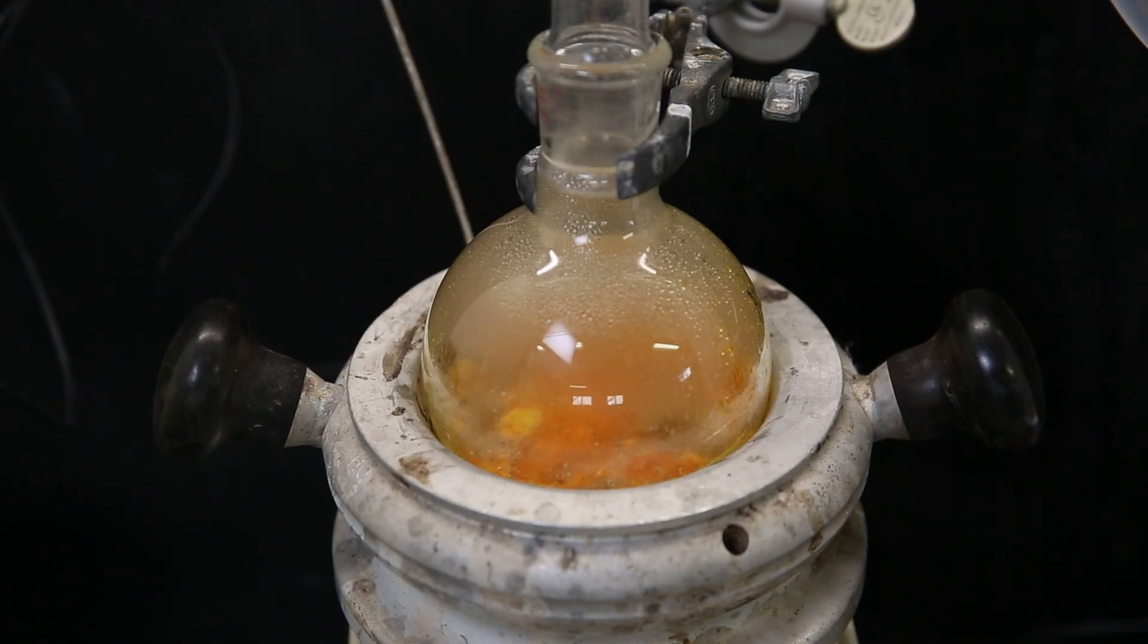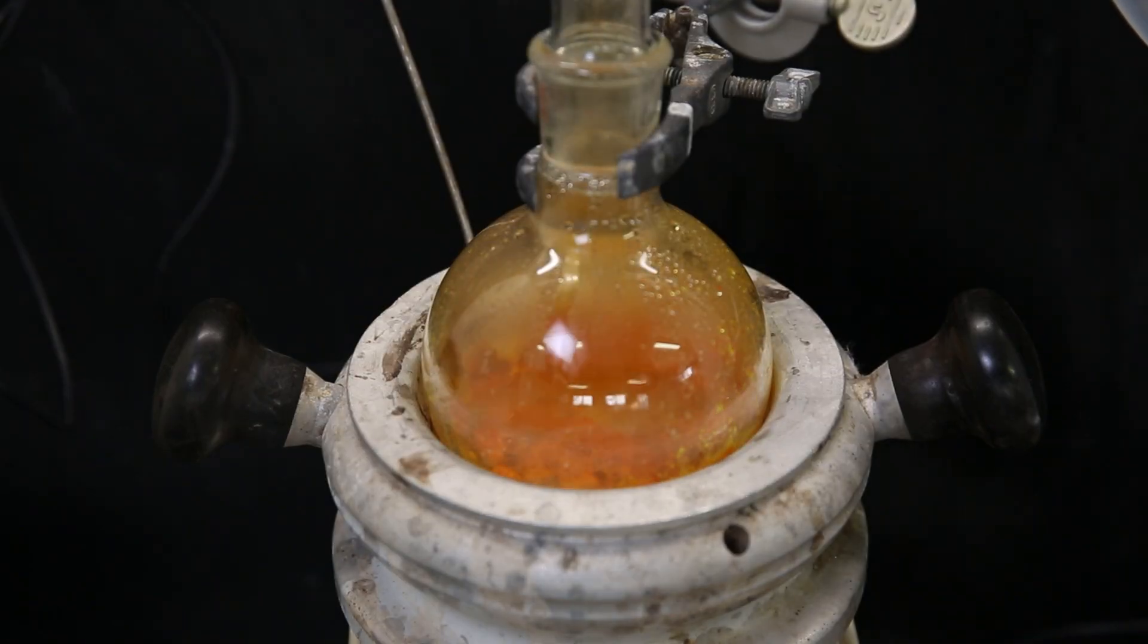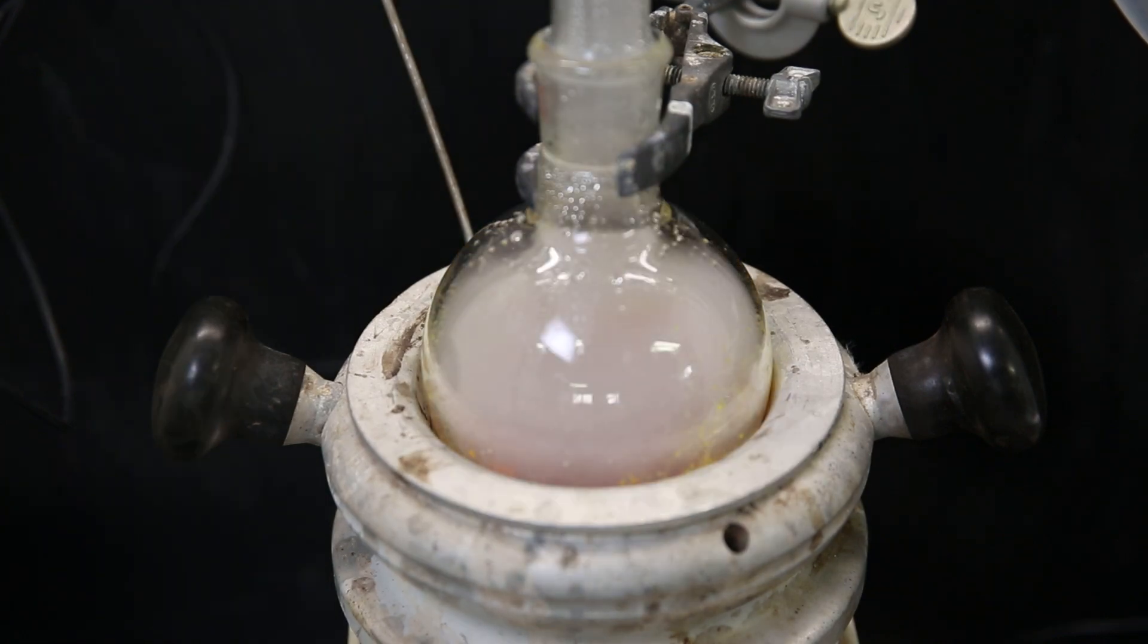Then at once a violent exotherm takes place and a lot of nitrogen dioxide is released. The mixture and solid both turn red from the nitrogen dioxide, and it slowly starts converting the solid to uranium tetrachloride with occasional exotherms and bursts of nitrogen dioxide. At one point the flask fills completely with white vapors.